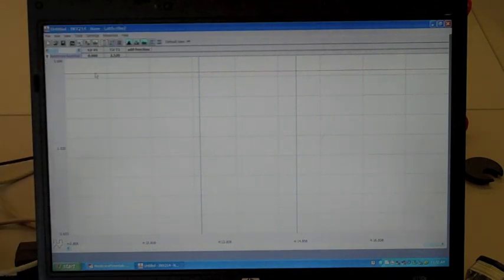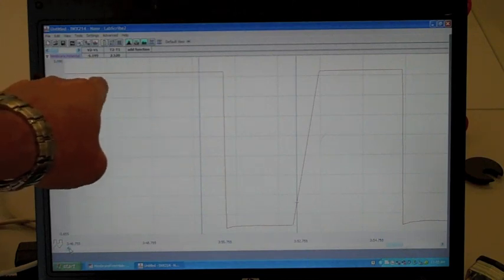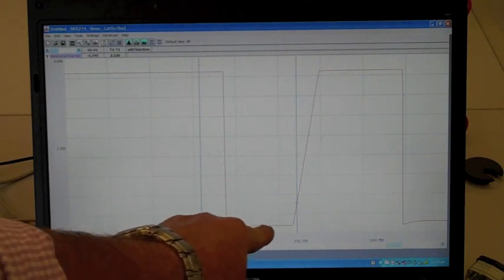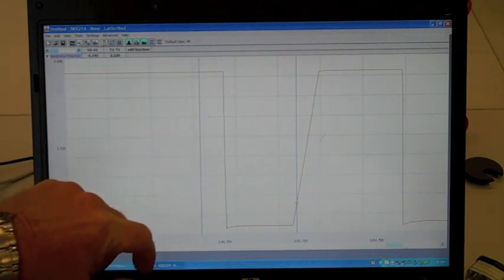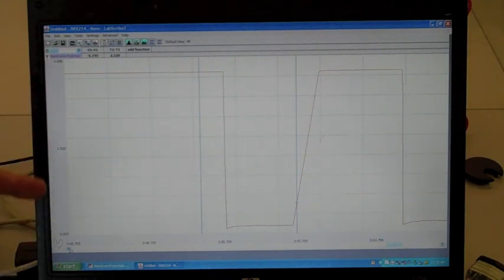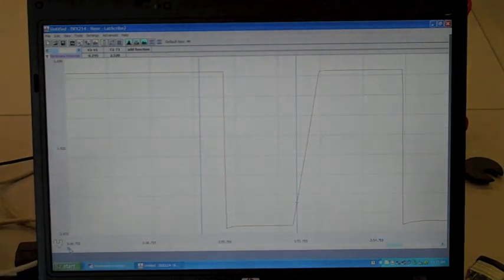So what I'm going to do is go back, scroll back along this timeline until I get to those events that I recorded earlier. This event was the last one I did, where the electrode was outside of the tissue. I pressed it into the tissue. So this is then the potential inside of the cell, and this is where I pulled it back out again. In order to retrieve or derive that number, I can either look along the left side of this scale bar, which is not terribly accurate because it's not well labeled, or I can utilize these two blue bars, which are now available to me in the analysis section.